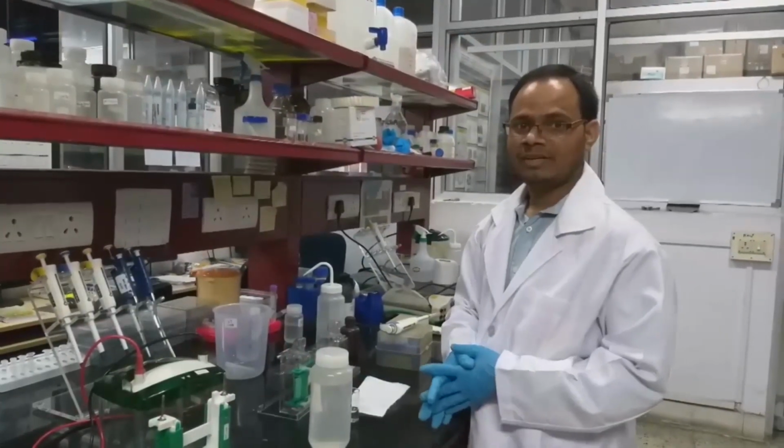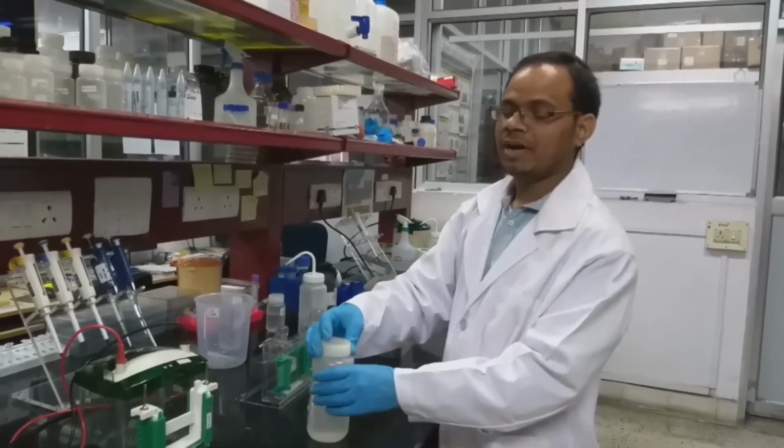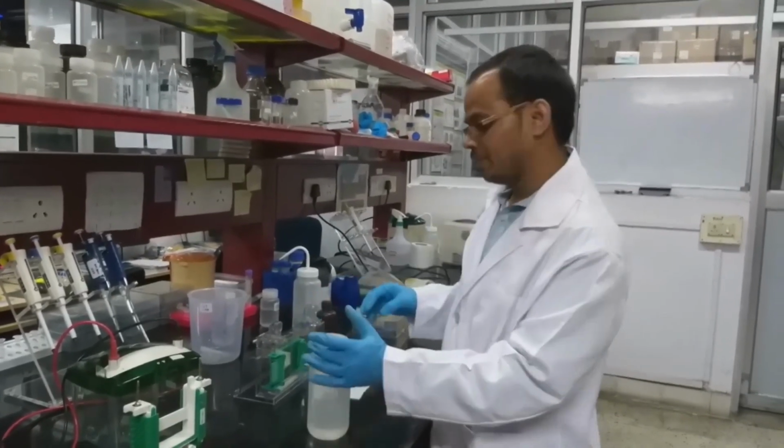The next component is 1.5 molar Tris pH 8.8. We have to add 2.5 ml.